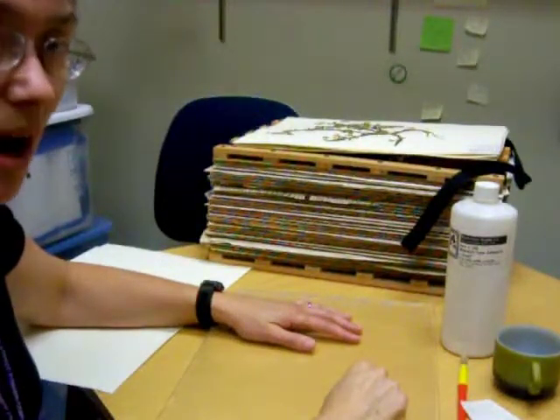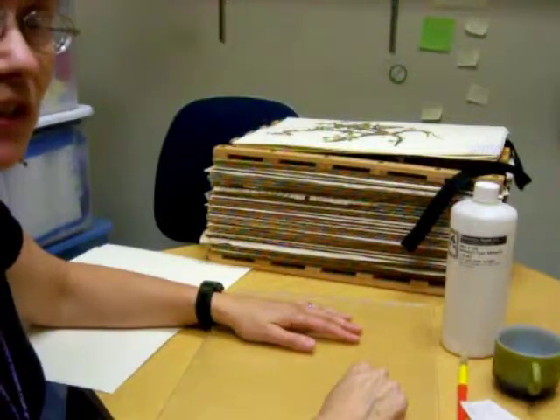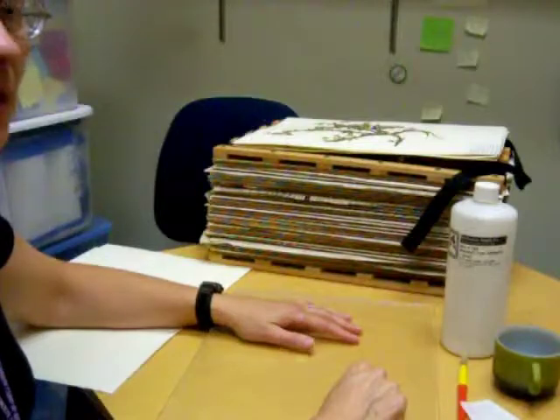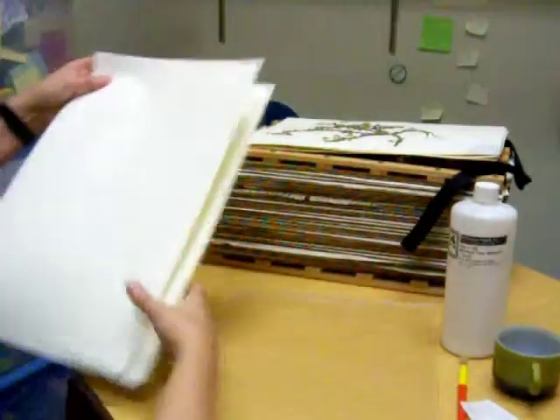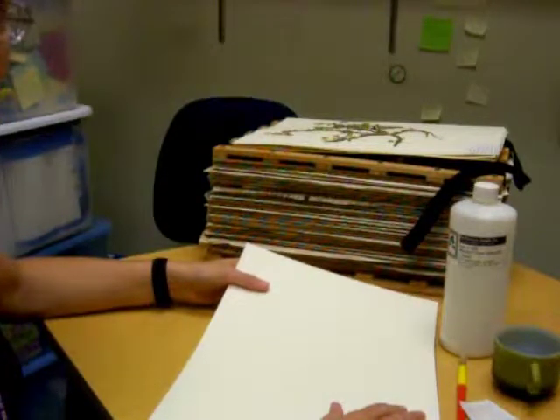When your plants are dry, you're ready to mount them on paper. In order to do this, you need to use special archival quality material. This paper is acid-free and it will last for hundreds of years and will not damage the specimen.